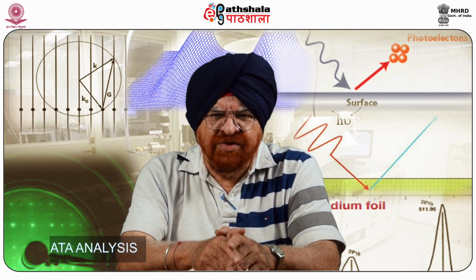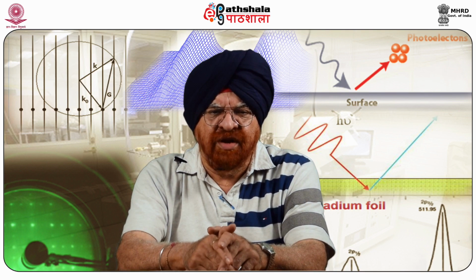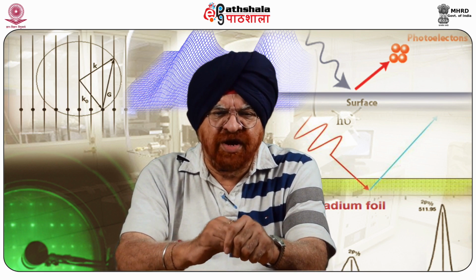Coming to the data analysis, we find that the ability to produce chemical state information, as distinguished from merely elemental information, from the topmost few nanometers of any surface makes XPS a unique and valuable tool for understanding the chemistry of any surface.